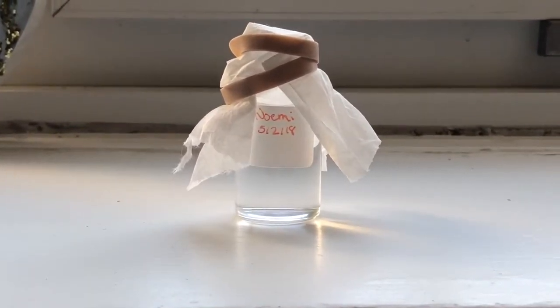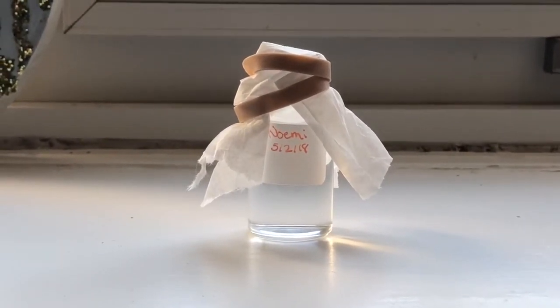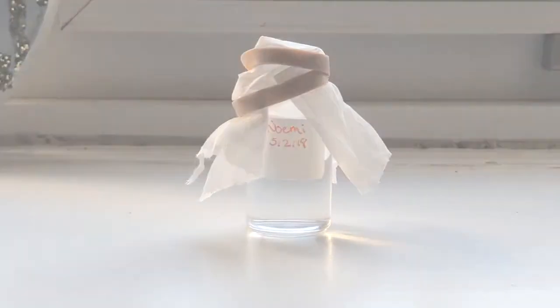There are probably no crystals yet because not enough water has evaporated and the concentration of the alum is not high enough to cause it to precipitate from the solution.